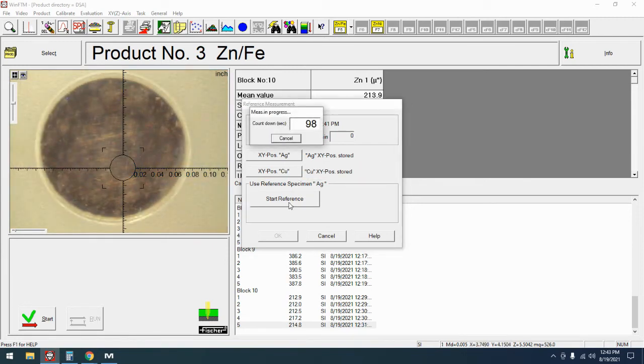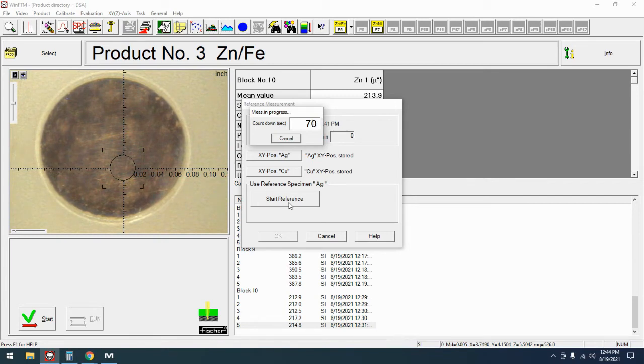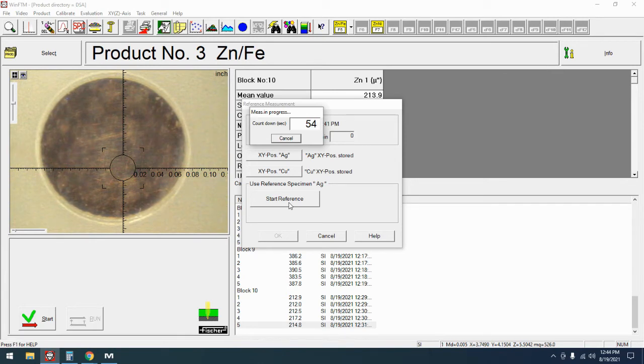As you can see because I programmed those in it's going to shift all the way back down and restart on silver. If you're doing this manually you'll just position silver and press start. Typically this is going to be a 70 to 100 second measurement time, again depending on the age of your unit and what version of FTM you have will decide that value.